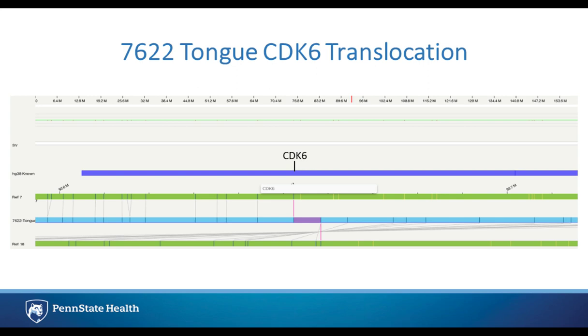And so you can see again the bands that are located on the genome, which is after staining with the DLE. We create that kind of molecular barcode, and it's being compared to the green, which is the reference. And so on top, we see chromosome 7. And we see that most of the banding on the left side are matching up. But then once we get towards kind of the middle of the screen, the banding starts to line up with chromosome 18. And so what we're seeing here then is a translocation. And as well on chromosome 18, it also looks like there's an inversion as well.